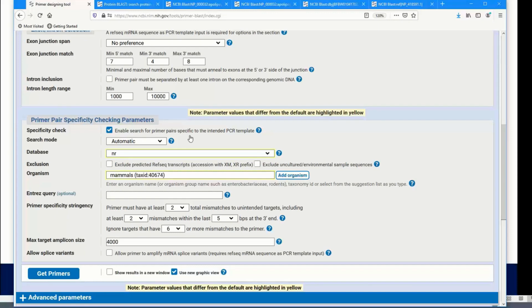What do my primers amplify? The other way, of course, is how can I make primers to amplify this particular sequence that I'm putting in the template box? Great. I have just two last questions since we're coming up towards the end, and they're both applied questions. And the first question, again, is kind of conceptual.